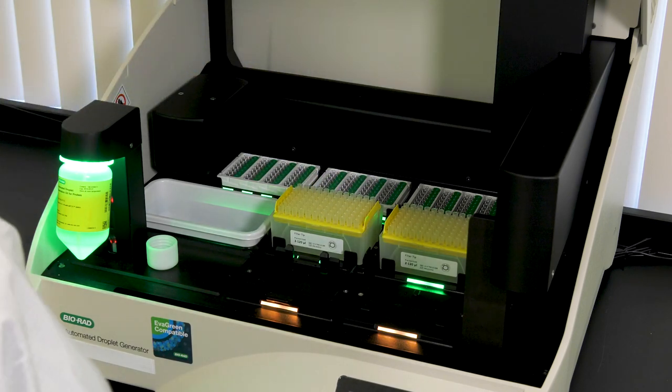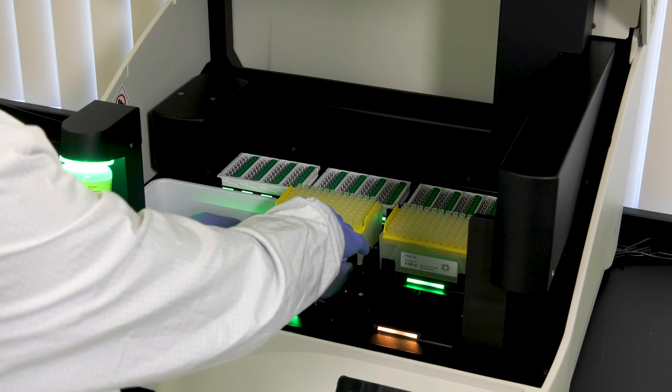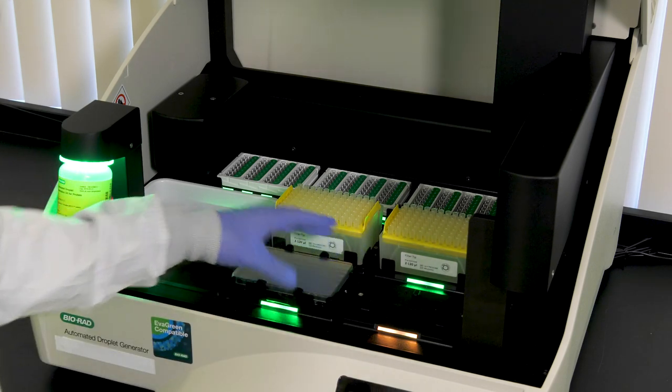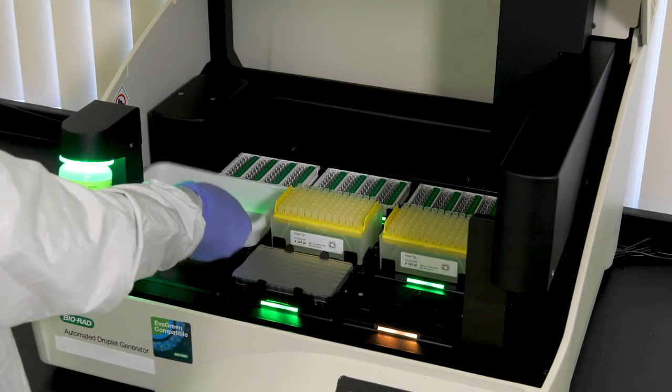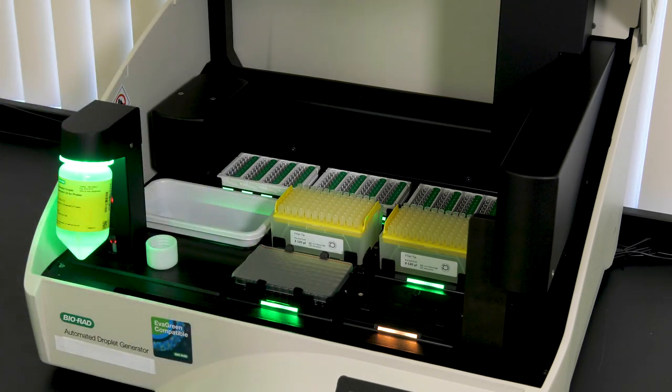Next, place your foil-sealed sample plate with 22 microliters per well at the front of the instrument, locking it in place with the locking tabs. Ensure that the plastic tip waste bin reservoir is empty.